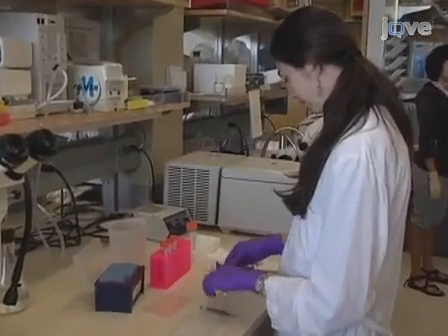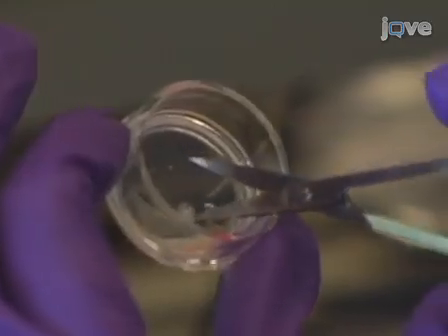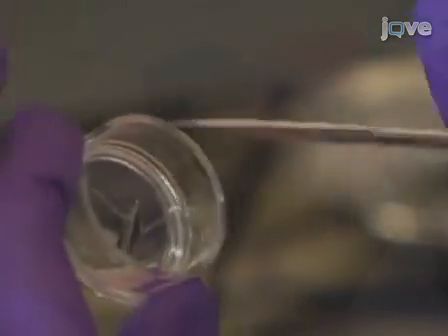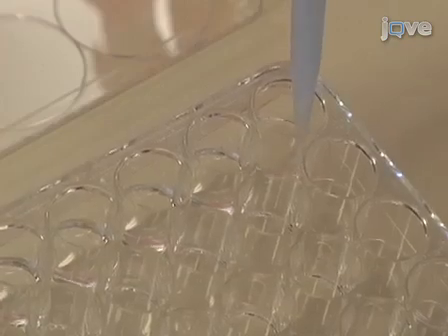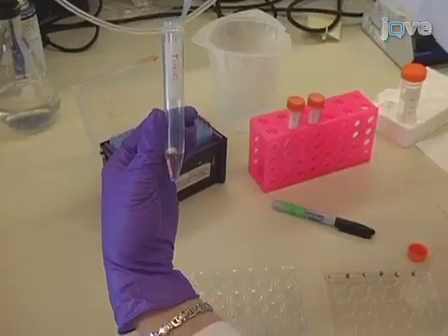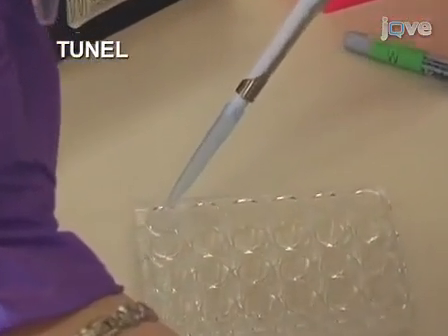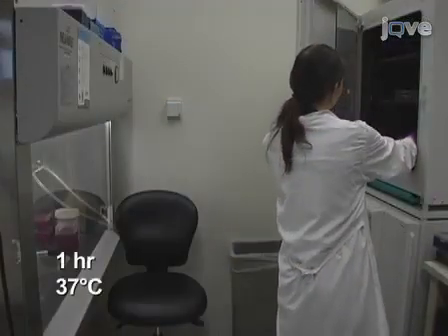When blocking is complete, use clean scissors to carefully cut the piece of membrane insert attached to the cerebellar slice. Then, use clean forceps to transfer the piece of membrane into a 24-well plate containing PBS. Aspirate the PBS and add 250 microliters of TUNEL reagent into each well, making sure that the reagent covers the entire surface of the slice. Incubate at 37 degrees Celsius for 1 hour in the dark.